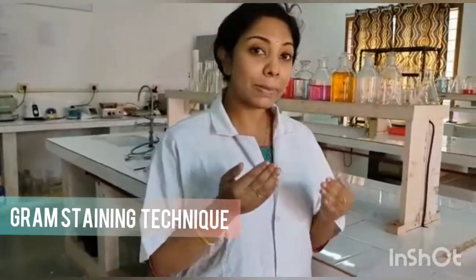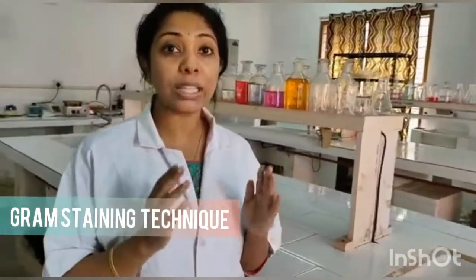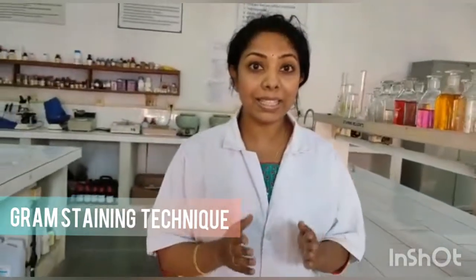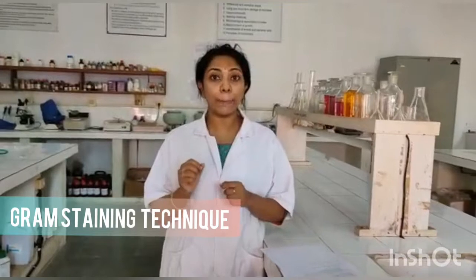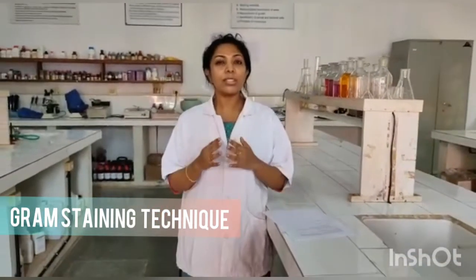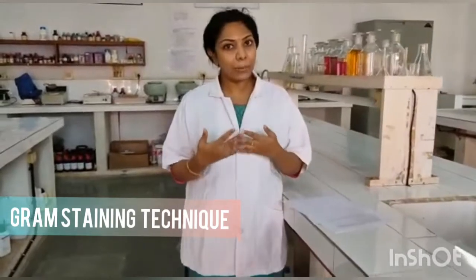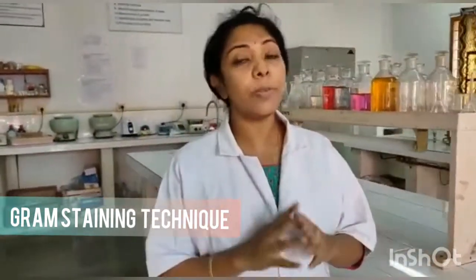This technique was introduced by a Danish bacteriologist called Hans Christian Gram, and that's why the name Gram staining has come. Gram positive bacteria stain dark purple and gram negative bacteria appear pink. This is a widely used staining method in microbiology and clinical microbiology labs as well. This is the first step in the identification of bacteria.